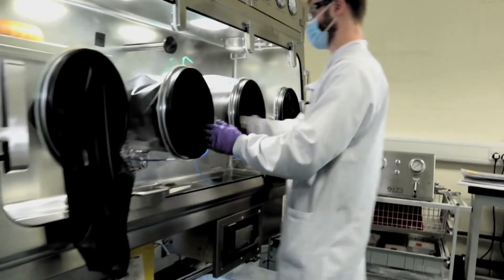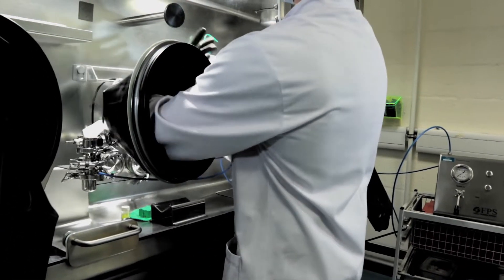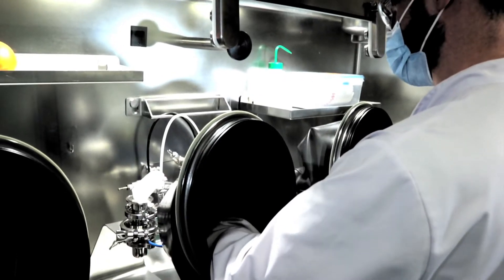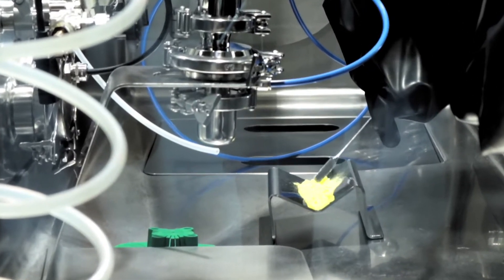We can generate samples for early development of pharmaceutical drugs as you may want to explore the influence of micronisation on bioavailability. We can rapidly mill samples in multigram quantities for early formulation and pre-clinical work.